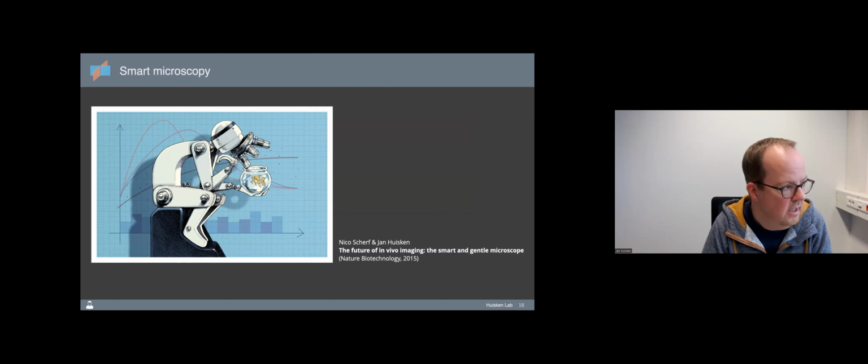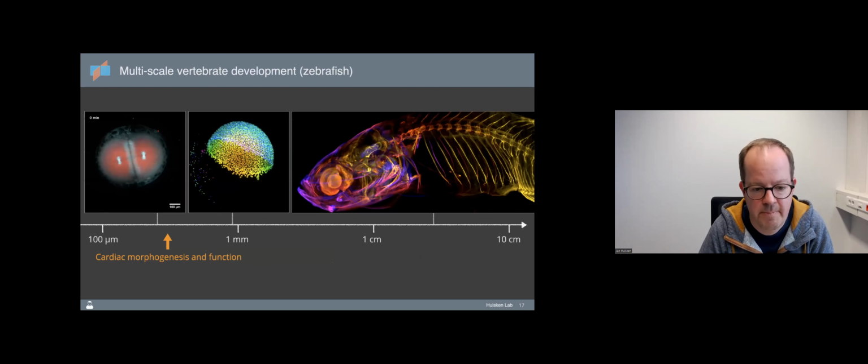And so this is a main question of ours that's gonna be with us for the coming years, I'm sure, or decades even, because it's not trivial to find the optimal image acquisition parameters for all these different questions that we're trying to address with these microscopes.